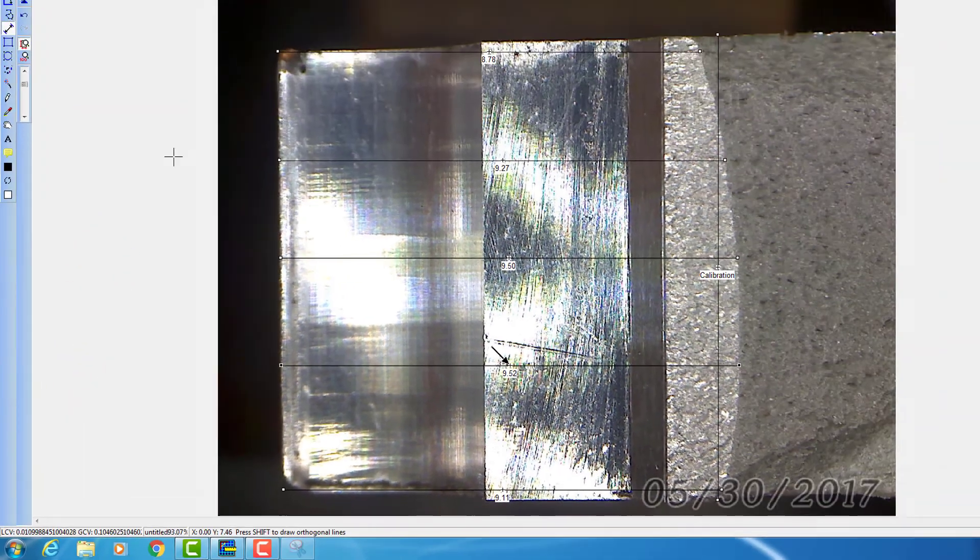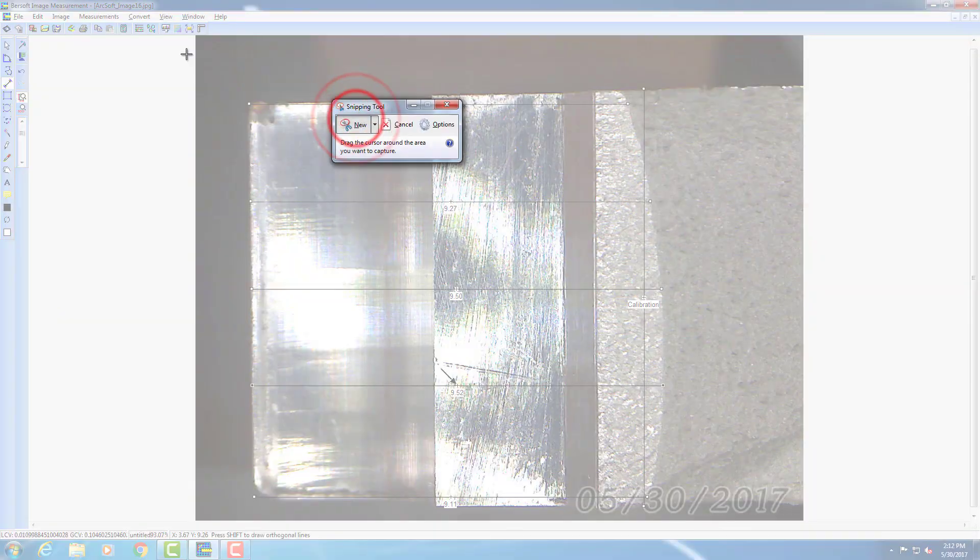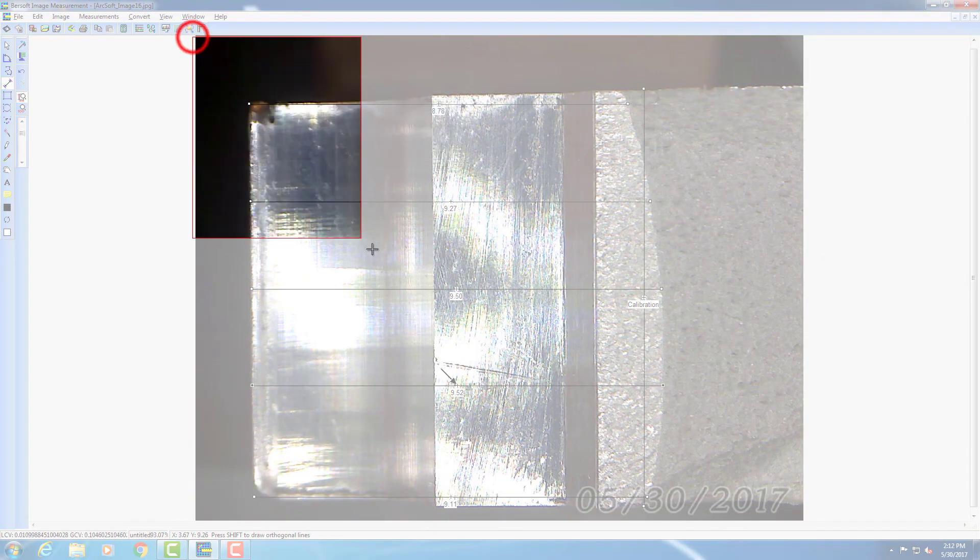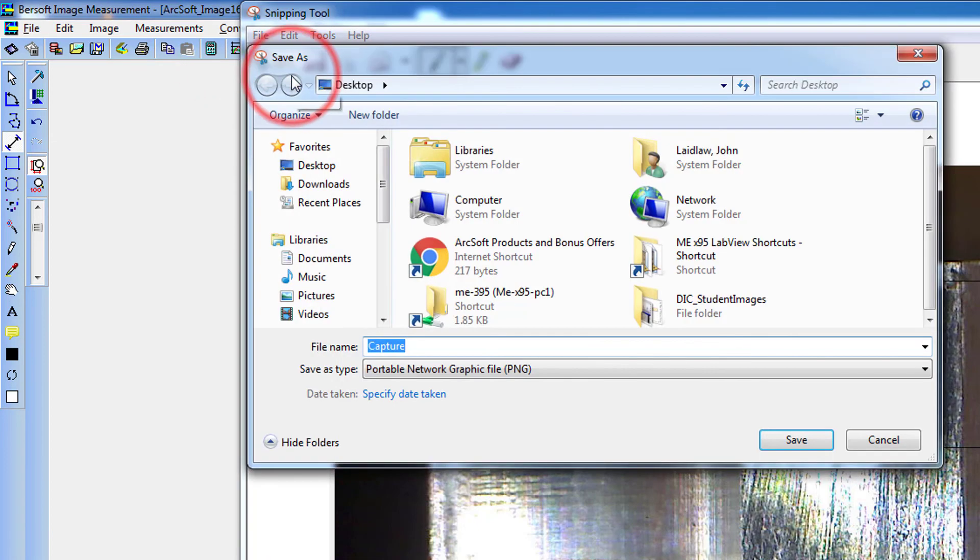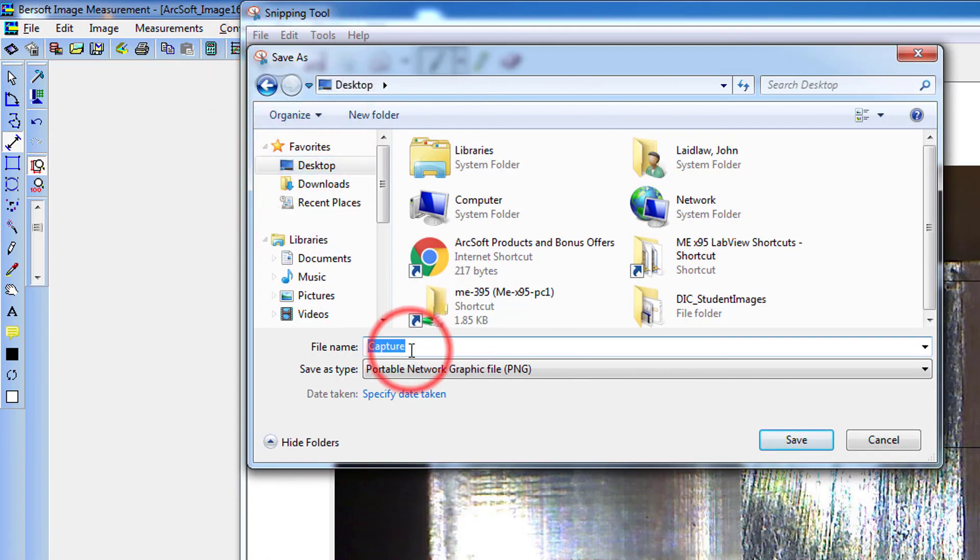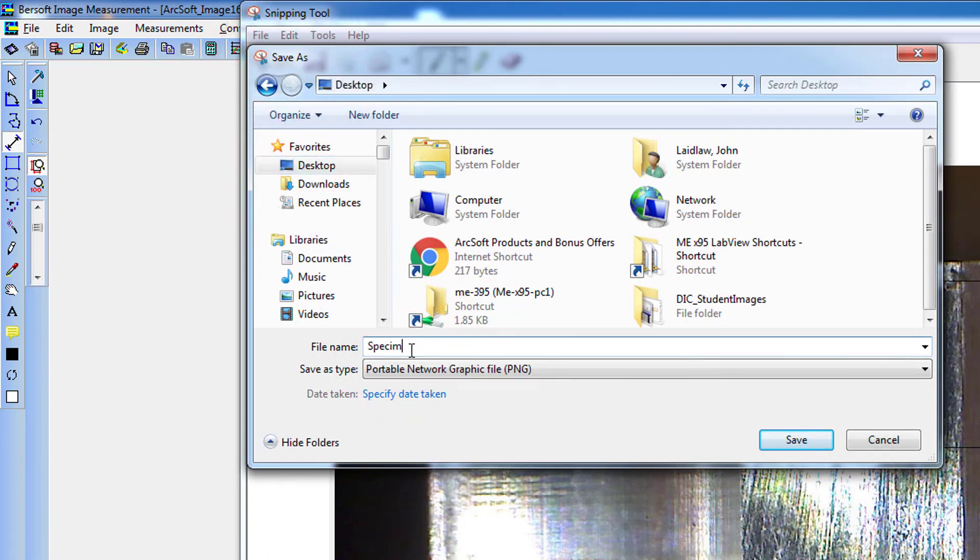use the Windows Snipping Tool to capture a picture of the dimensioned image and save to the desktop. The save feature in the software yields an image with unreadable dimensions, hence we recommend the Snipping Tool. Exit the program when you're done.